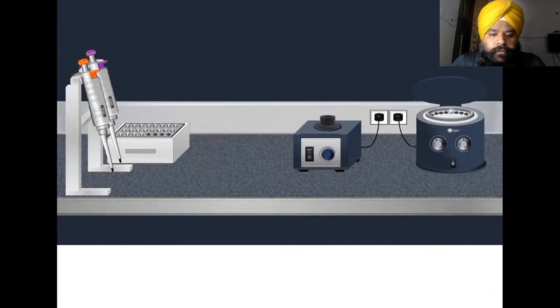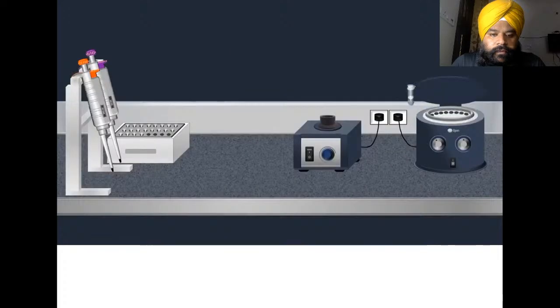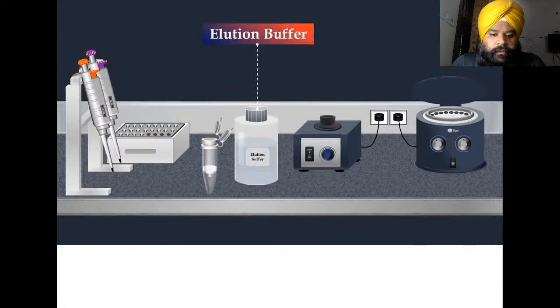The column is put in a centrifuge again, forcing the wash buffer through the membrane. This removes any remaining impurities from the membrane, leaving only the RNA bound to the silica gel. Once the sample is washed, the column is placed in a clean microcentrifuge tube, and an elution buffer is added.